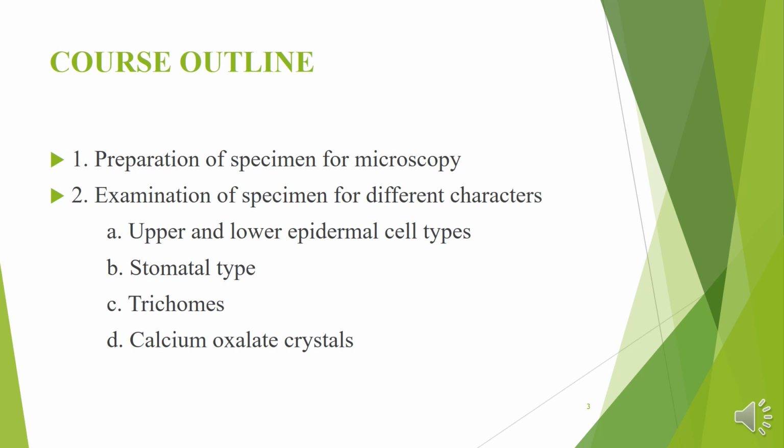We'll be looking at how to prepare the specimen for microscopy. We'll also examine the specimen for different diagnostic characters, whether it's the upper and lower epidermal cell types, the stomatal type, the trichomes, and the calcium oxalate crystals, if they are present in your sample.